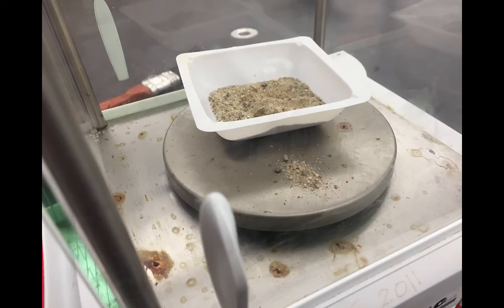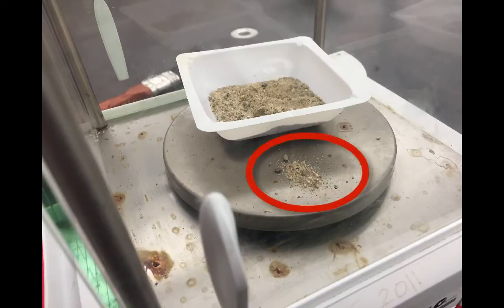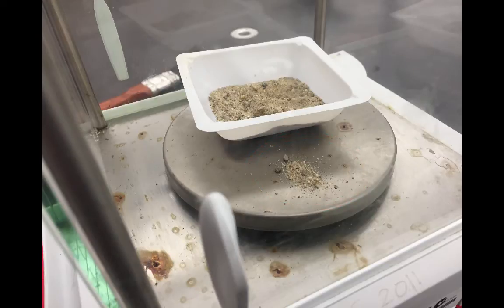We'll wrap up today's talk on balances with a discussion of the potential sources of error you might run into while using a balance in your experiment. The first source of error we can see here in the picture. As you can see some of the material we're trying to weigh with this balance has been spilled onto the pan. The problem in this type of a scenario is the mass of that material will be recorded by the pan, but when you remove that material in the dish from the balance itself, you'll have less mass actually used in your experiment. This discrepancy in masses will lead to an assumed larger value or larger mass of material used than you actually are, introducing error into your experiment.